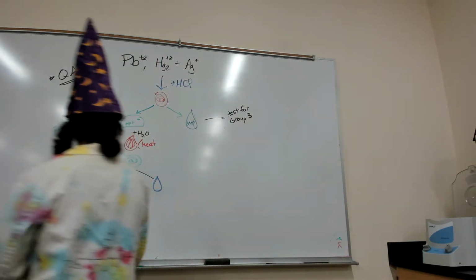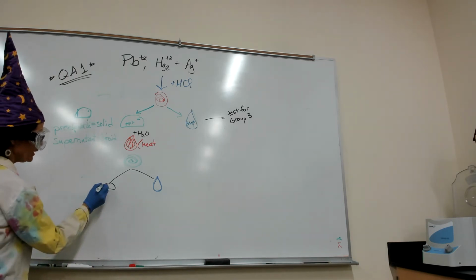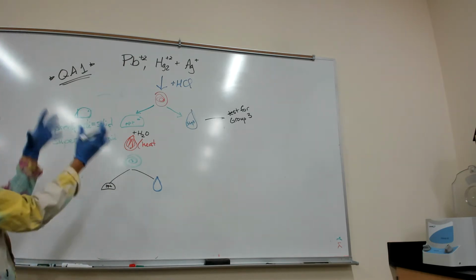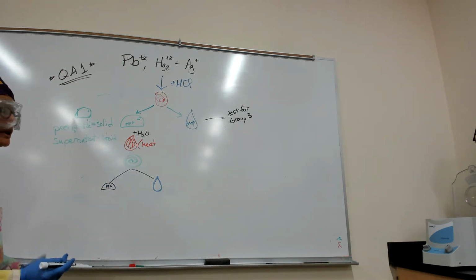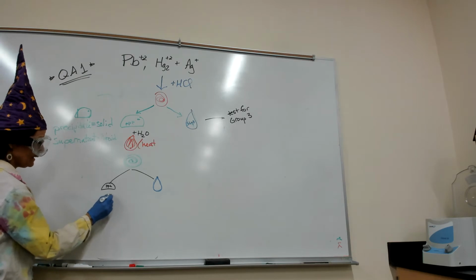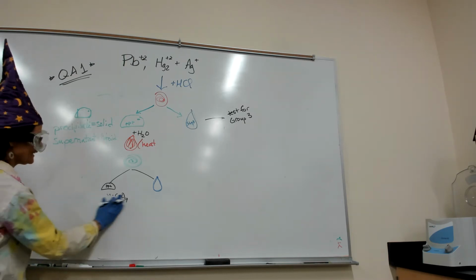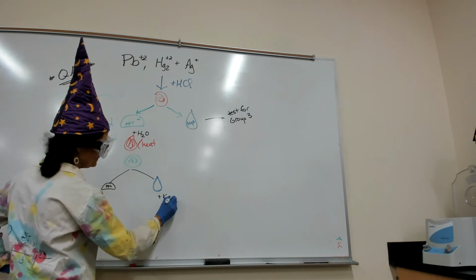But in this case, after we centrifuge, this is my precipitate, and if you want, we can write PPT. Every time you do a step, you show it in a specific color. Every time you have precipitate, you have a shape that shows that. To the supernatant, we're going to add potassium chromate.